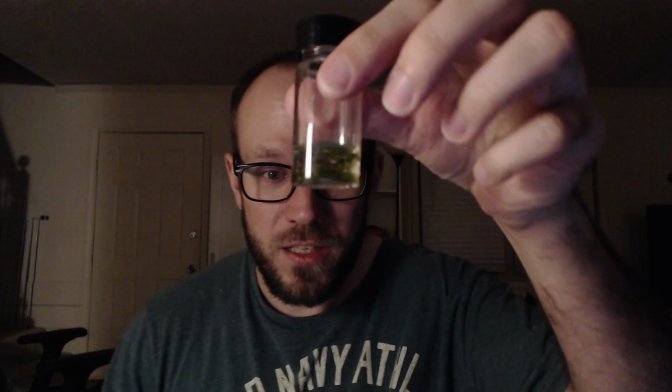This was all crimson the other day, and I'm pretty sure that bacteria just kind of destroyed the whole sample. So I need to sanitize my hand again, because now that I touched that, I saw under the microscope just tons of bacteria. In fact, I'm going to just sanitize my hand right now. I have hand sanitizer up here because I don't want to give myself the shits from looking at microscopic organisms.